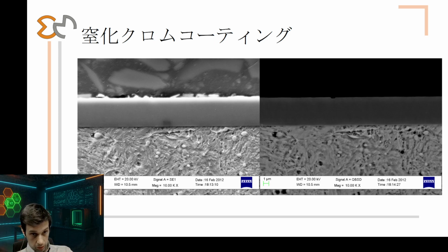And in the bottom region, there is a lighter gray area. This is steel. Steel has chromium, iron, nickel, etc. All these elements are very heavy, and that's why it looks more white. There are some black regions inside of the steel. These are large carbides.